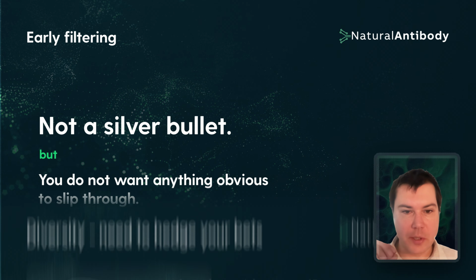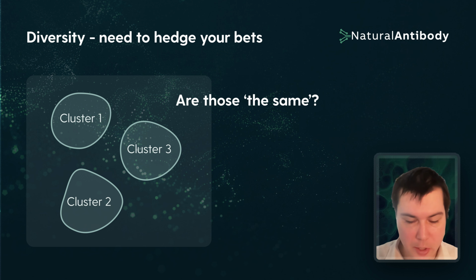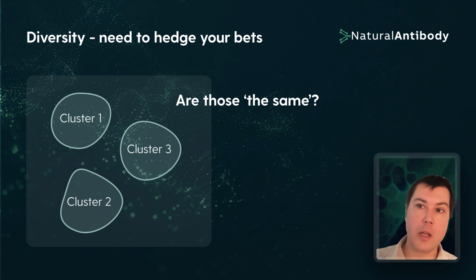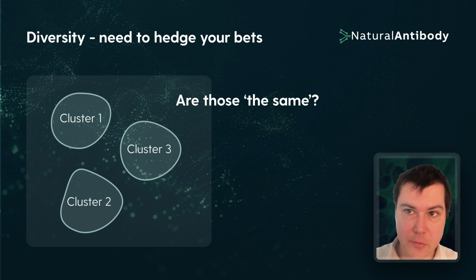Then going towards the diversity. When we start with a whole bunch of sequences, whether we are doing the enrichment from phage or the clonal selections from immunization, you end up with a smaller amount of sequences. I would like to have those sequences diverse.